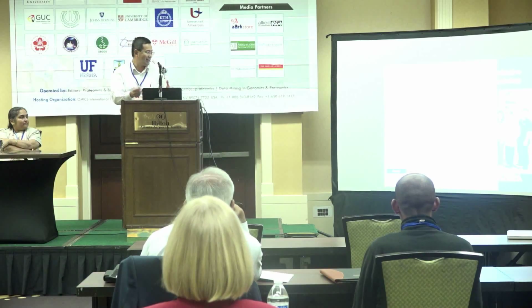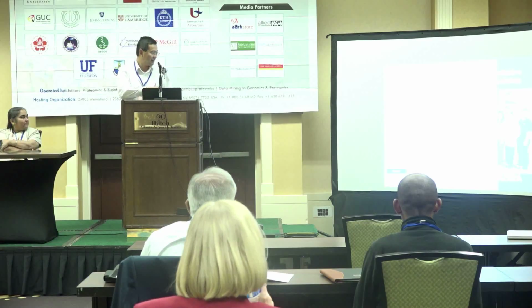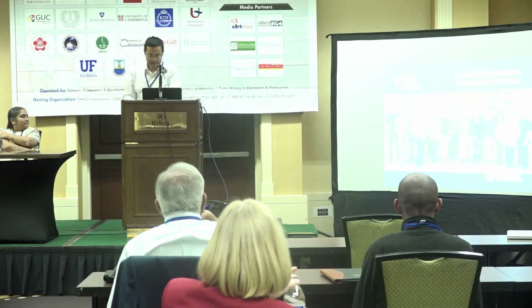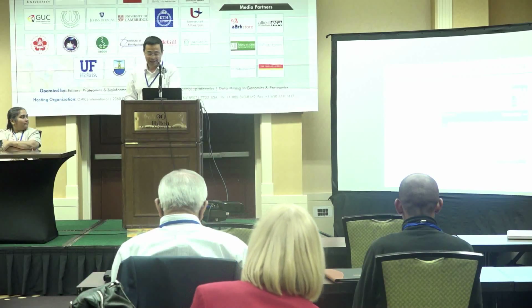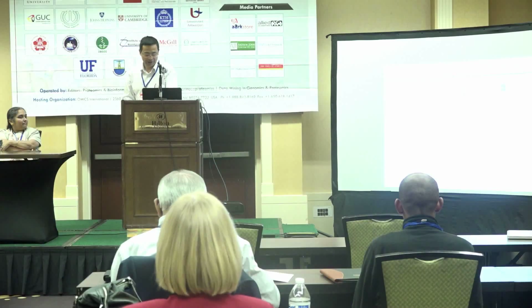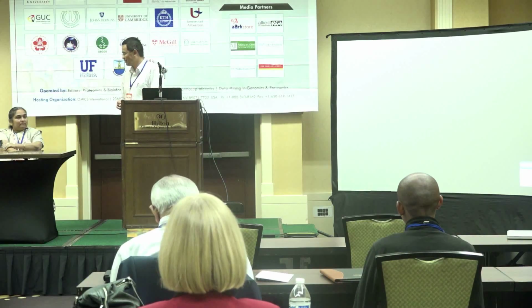People are doing hands-on protein extraction, labeling, then LCMS, then data analysis. I have a flyer over there. So this is a quick highlight about proteomics, why we love proteomics. I don't want to spend too much time just talking here, so maybe our panel members want to talk.